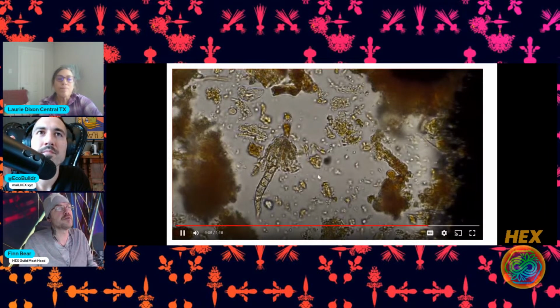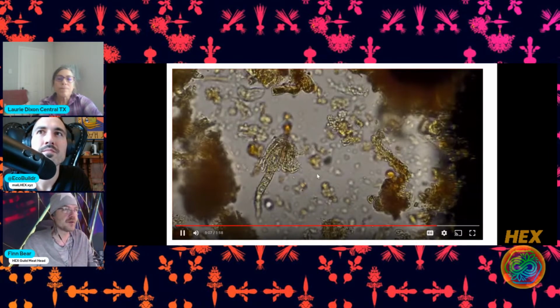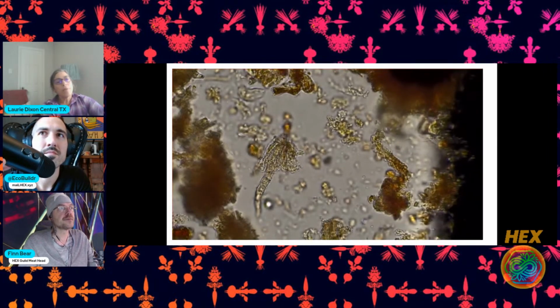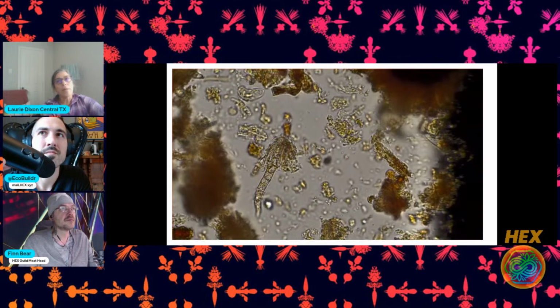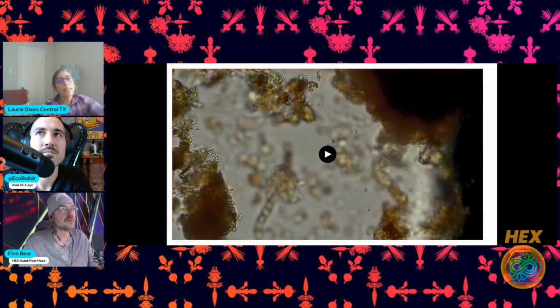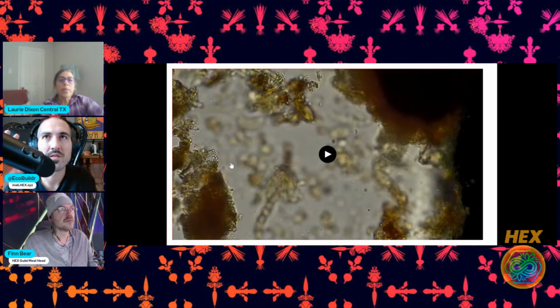How long do they survive between the plates? So the drop, it depends on your environment. Again, if you have low humidity, or if you have a breeze or whatever, it's going to dry out a lot faster. You can see it drying out because it starts kind of floating, and then the edges start kind of swallowing up everything. Is this usually out in the landscape, or do you bring it back to the lab? This is in the lab.